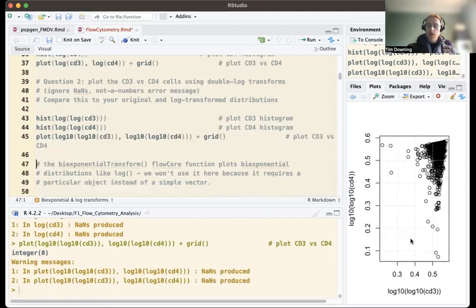So what you see there is that the shape is the same, though the scales are slightly different. And what you see is that they're all compacted in the upper right quadrant. And some smaller values are scattered around below there, which maybe are less interesting. So if we're plotting like this, one way of getting around that would be simply to limit the axes according to the log scaling.